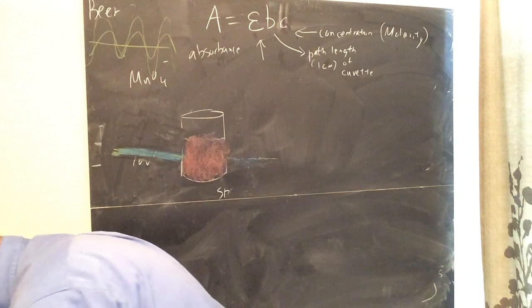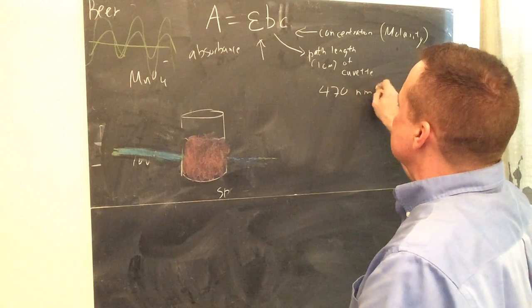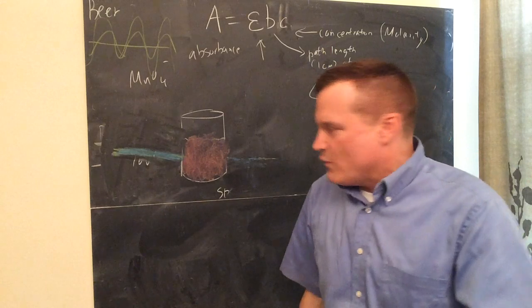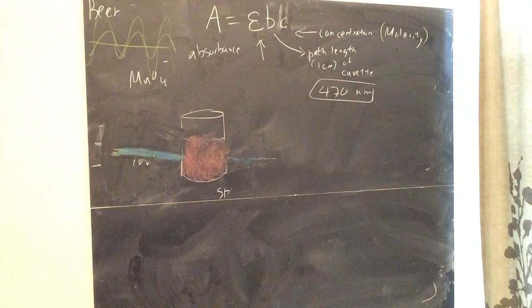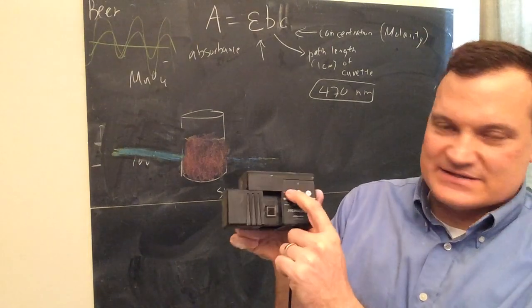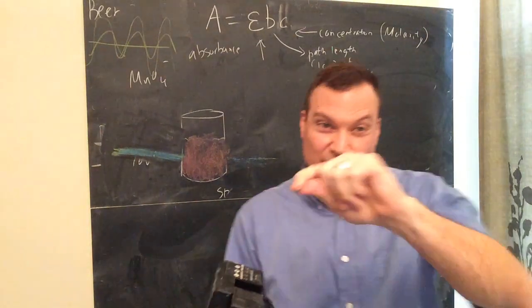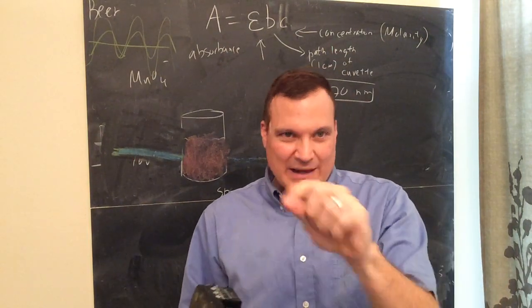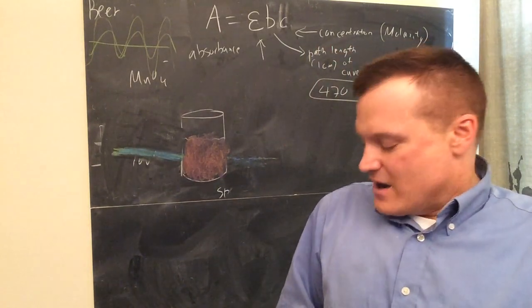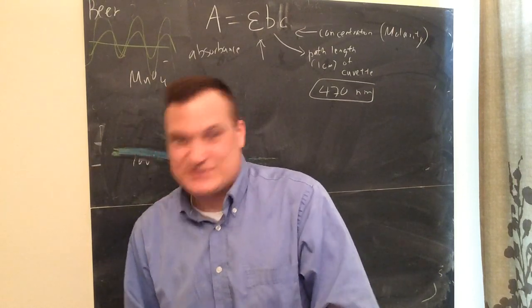If you did the experiment, we'd say, okay, set it on 470 nanometers. Or if it had been the green light, you set it on the one I showed you, 565. All right, what's the point? So I'm going to set this little colorimeter or spectrophotometer on 470 nanometers. That means only a bluish light will shine through, a blue, like a laser pen blue light, what you saw on the others. Now, let me tell you a little bit about the procedure. I've got to tell you about the procedure first, and then I'll get to more of the math.